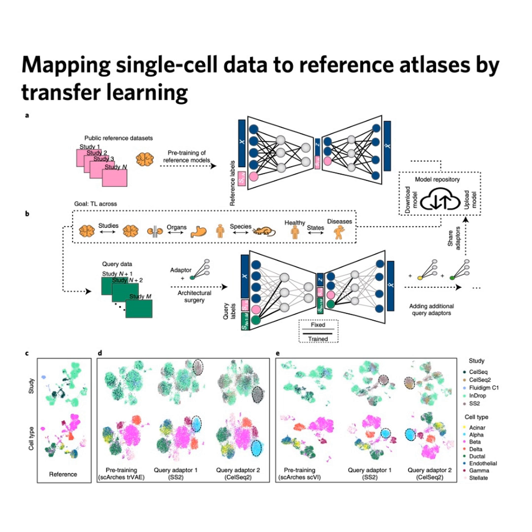So let's recap again. We've seen scArches is fast, it's accurate even with rare or similar cells, and it can transfer knowledge, both simple labels with a crucial uncertainty score and complex continuous data like protein levels. Which brings us to the highest stakes application of all. Using it to understand disease. Exactly. Contextualizing disease data against a healthy reference is the ultimate goal.